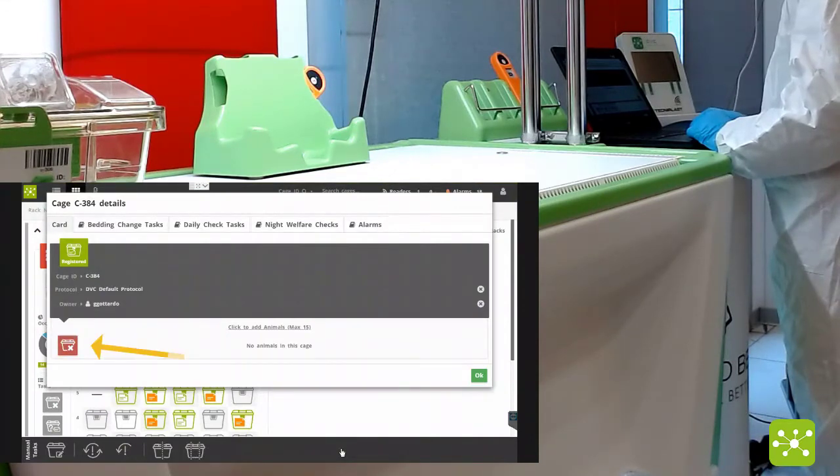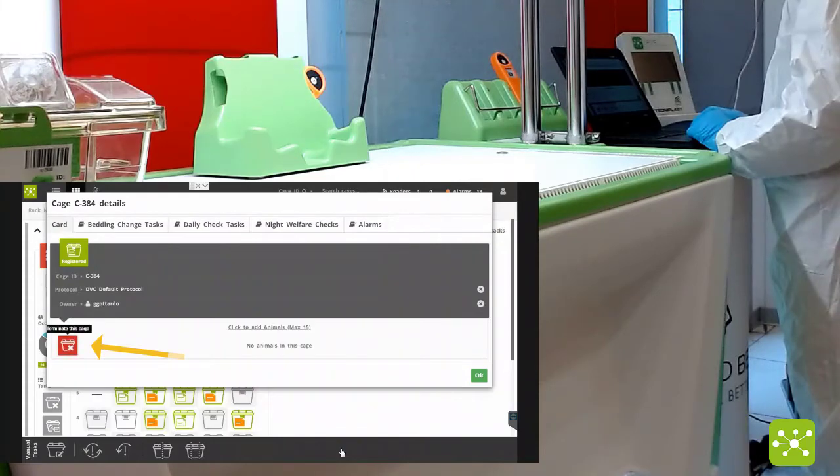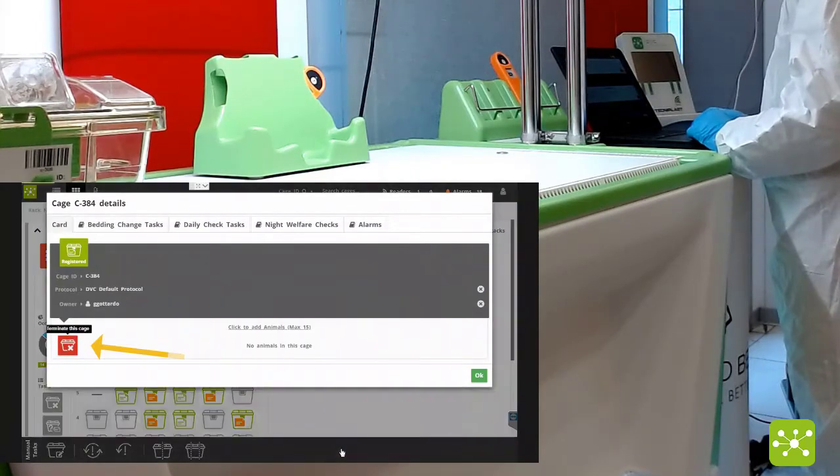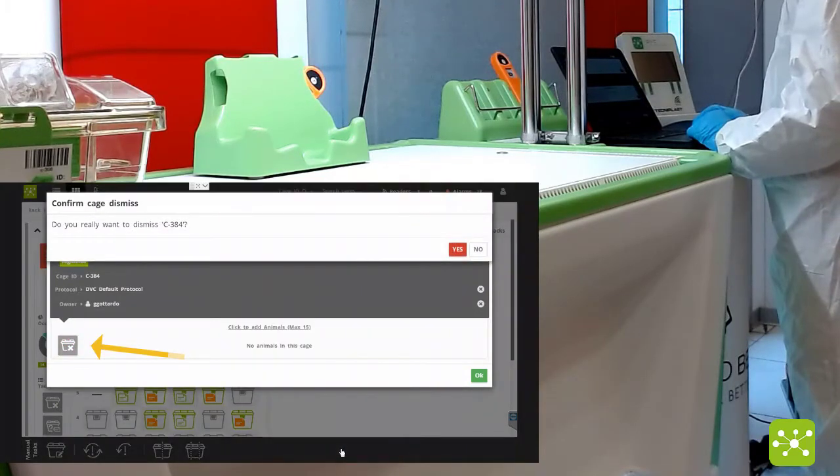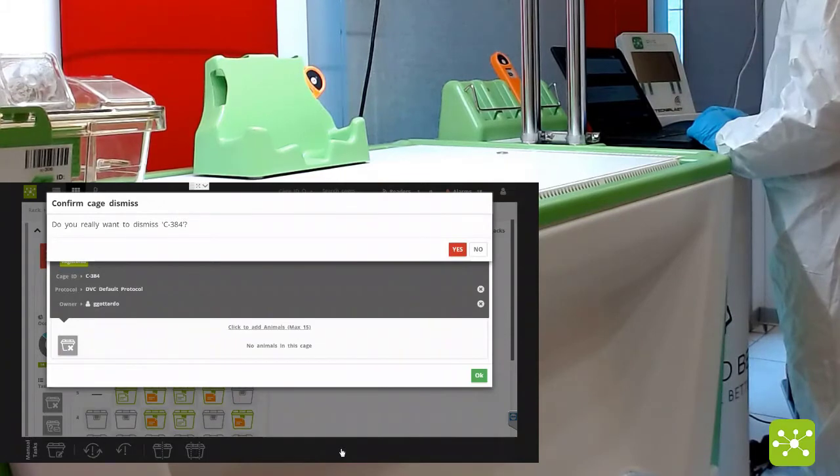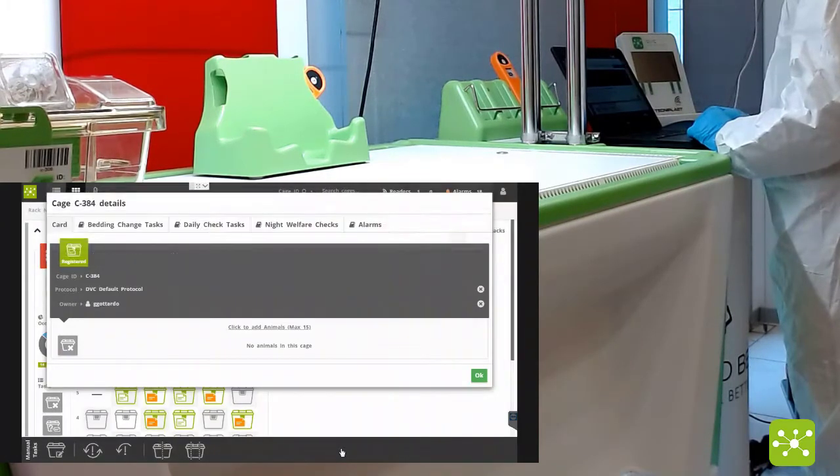Now again, the cage is empty but there is a new icon appearing on the left of the cage label. If you click on terminate this cage, the system again will ask.